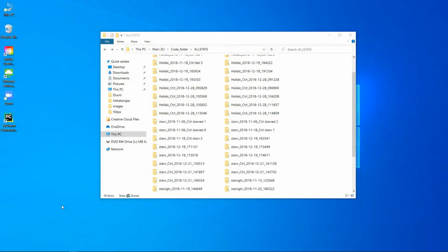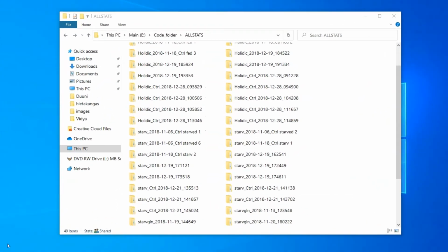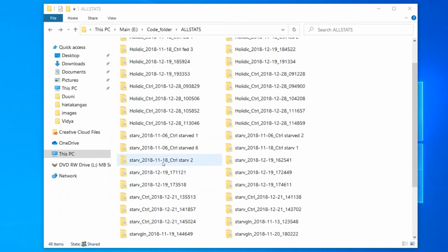First, each sample's data must be placed within the analysis directory in separate folders. The analysis directory should only contain files created by LAM and the user-given samples. Any additional files may cause errors when using the tool. The folders must be named according to practice, where each sample has its sample group at the beginning, followed by the sample's name separated by underscore.